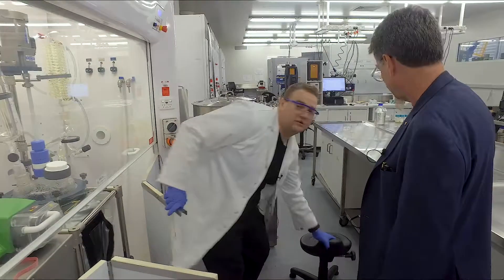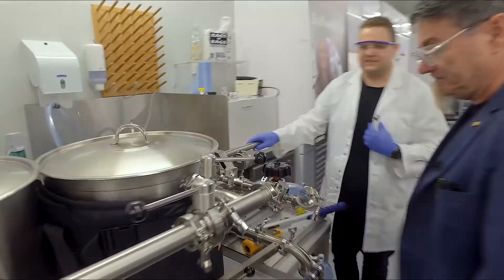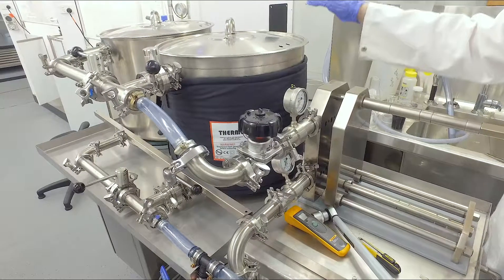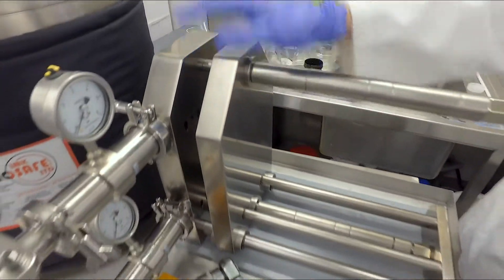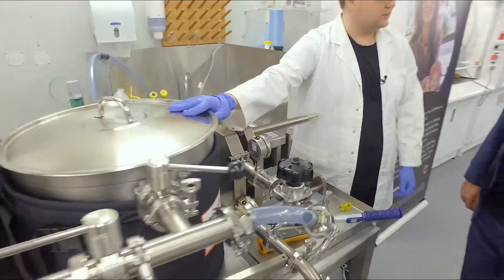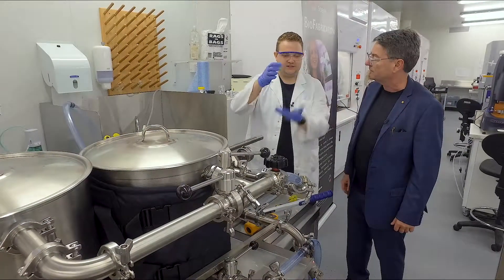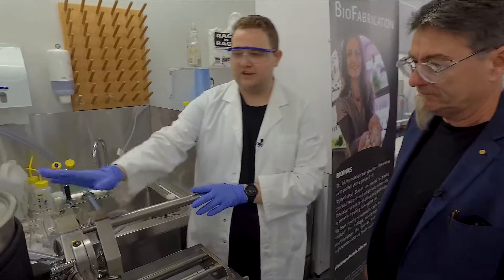The first step in that process is to purify it. On a kilogram scale, this is our new piece of equipment that we have recently customised — a cross-flow dialysis purification system. This system is capable of running through about 140 litres of our reaction mixture. It'll pass through a membrane that works via dialysis, throwing away any side products and impurities we don't want and leaving us with the pure material. On the small scale, we would be doing dialysis in dialysis bags, which could take up to three to four days, limited to one gram. This allows us to generate kilogram batches in two days.